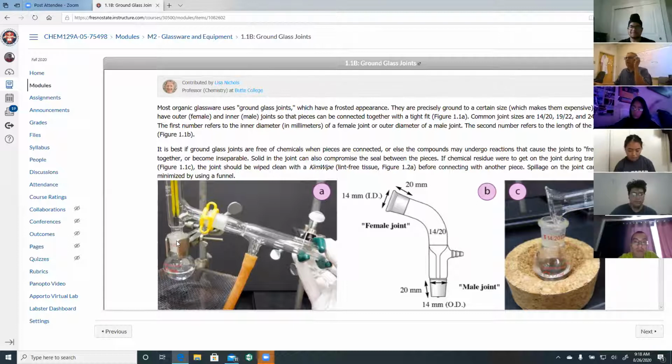Okay. So when you are actually in a real lab, and if you are going to break something, I'm being sarcastic and funny, trying to be funny. It's always good to break a glassware that doesn't have ground glass joint. Why? Expensive. Each ground glass joint used to add like $5 to the value of the equipment. So this round bottom flask has a ground glass joint, a female joint. It's probably more than $5. This distillation head has one and two, definitely two ground glass joints. It's definitely more than $10 worth.